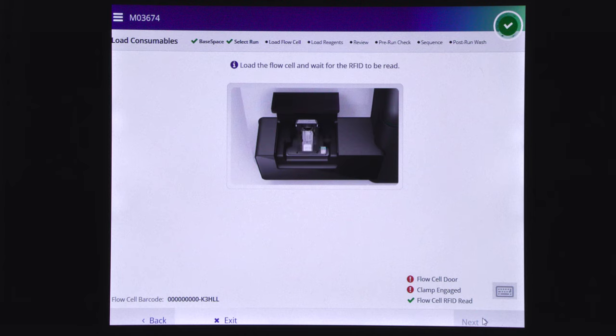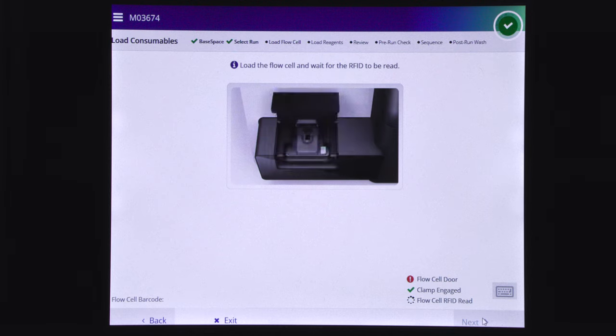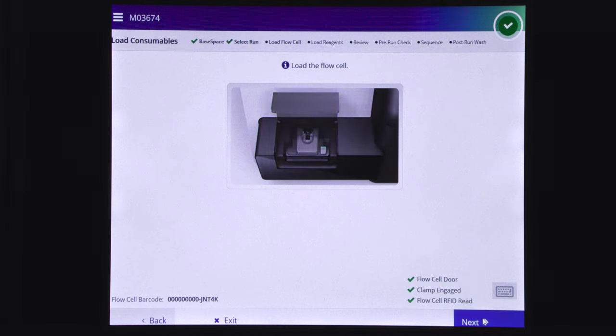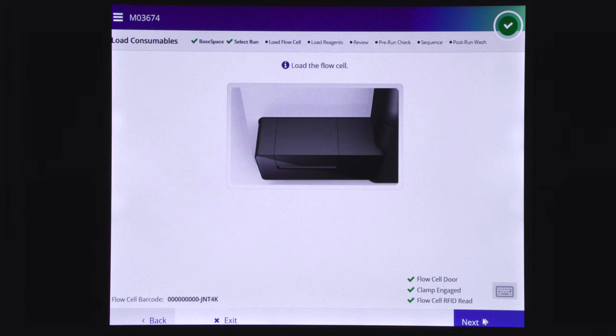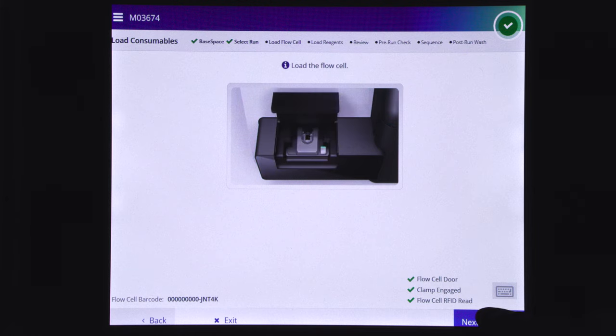At this point, the control software will identify the RFID of the flow cell. If the software does not identify the RFID of the flow cell, check the Resolve RFID Read Failure section in the MySeq system guide. After RFID identification is completed, select next.